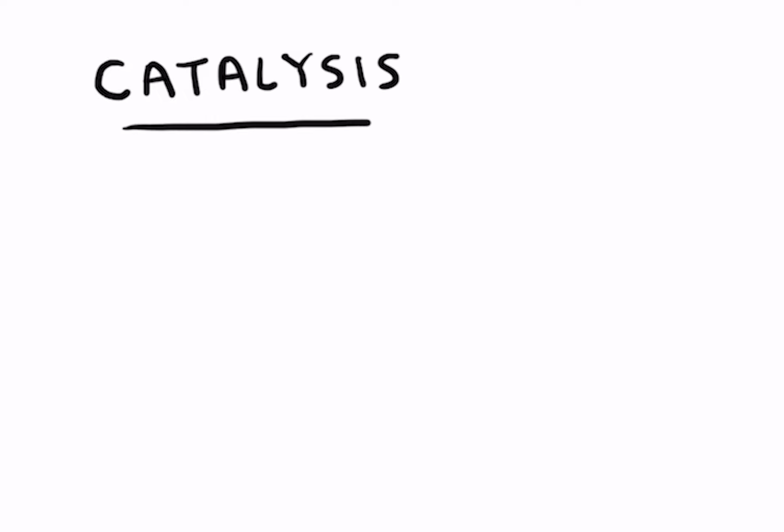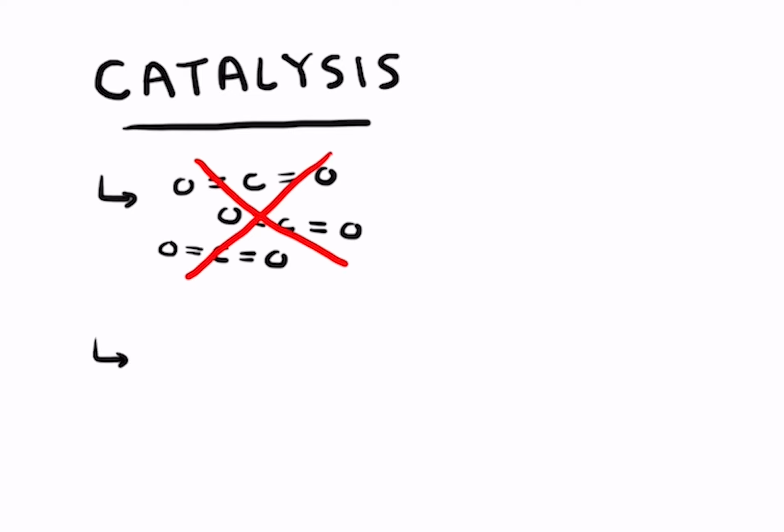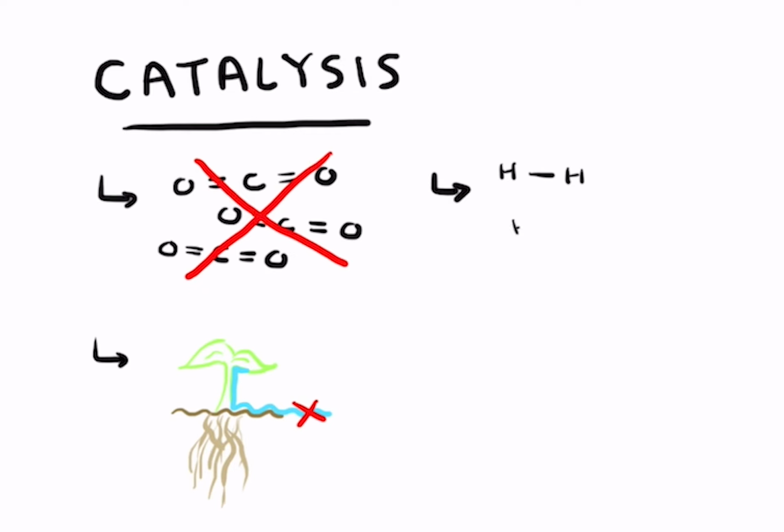Another part of the Cossairt group conducts research on using nanoparticles for catalysis, or helping to speed up chemical reactions. Some of the potential applications of nanoparticles for catalysis include removing CO2 from the atmosphere, nitrate reduction, or recycling wastewater from fertilizer, and hydrogen evolution, the production of hydrogen gas for fuel.